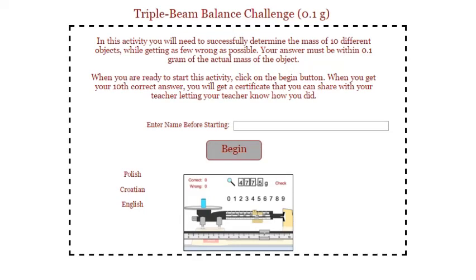We're going to learn how to do a little balancing act here on the module six skill builder about the triple beam balance. If you've never used a triple beam balance, this is something you would become quite familiar with in a traditional lab course. Triple beam balances measure mass, and this is the best we can do as far as doing a simulated experience with a triple beam balance.